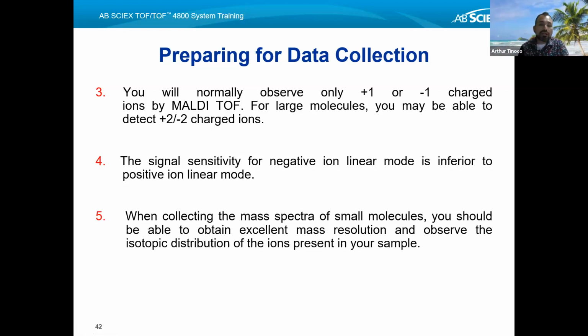And then when collecting the mass spectra of small molecules, you should be able to obtain excellent mass resolution and observe the isotopic distribution of the ions present in your sample. Again, this is for small molecules. So we're getting back to that concept of isotopic distribution, which I have not yet defined, and we're going to do so in a moment.